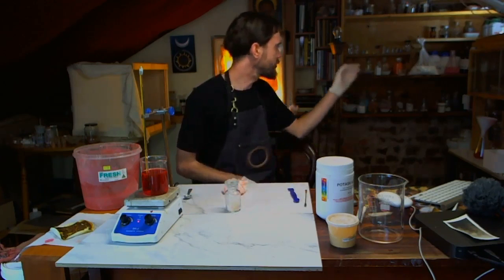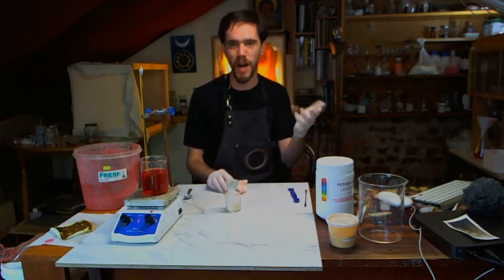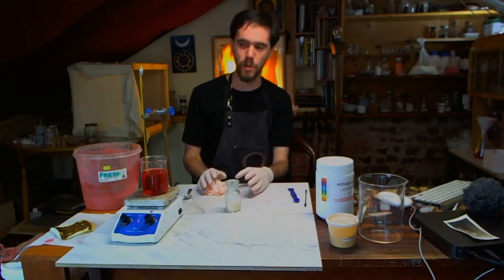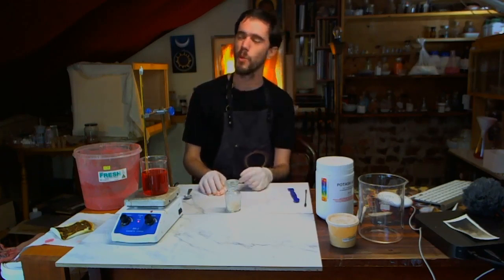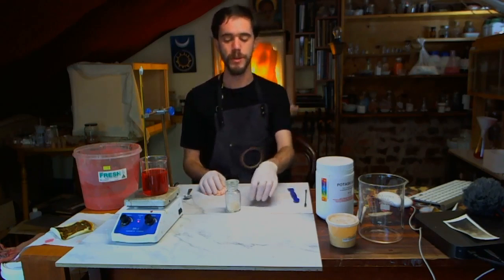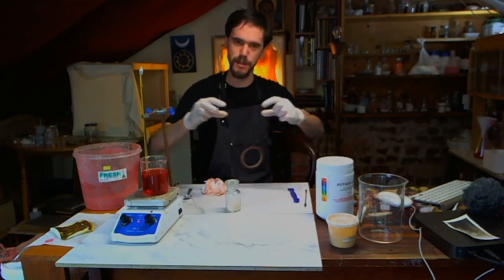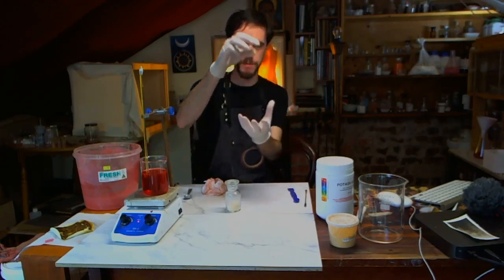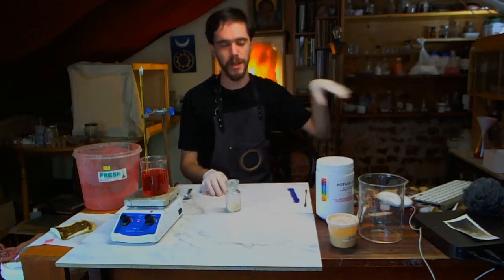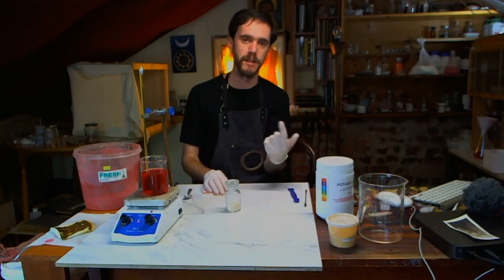So vinegar. I have glacial acetic acid, which is pure 99% acetic acid. I think you could use regular vinegar, but that's quite a lot less strong. It's definitely not as strong a concentration of acetic acid. What I did is I had some chunks of lead that I hammered down into thin foil, so like lead foil. And I just put the small chunks of lead into an Erlenmeyer flask in the fume cabinet, and with the stir bar, which I've lost, I just stirred it with hot glacial acetic acid.